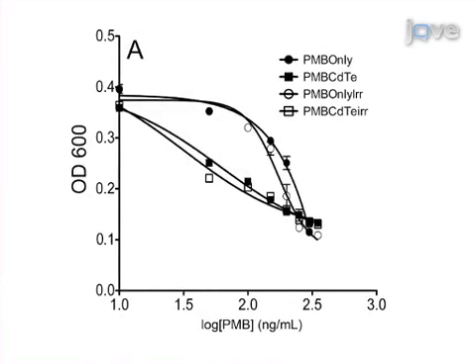The resulting data indicate that application of antibiotic-conjugated cadmium telluride quantum dots followed by irradiation yields the greatest bactericidal effects amongst the conditions tested. Though this method can provide insight into the effect of cadmium telluride quantum dots and their conjugation to polymyxin B on E. coli growth, it can also be applied to other types of nanoparticles and antibiotics on various bacterial strains.